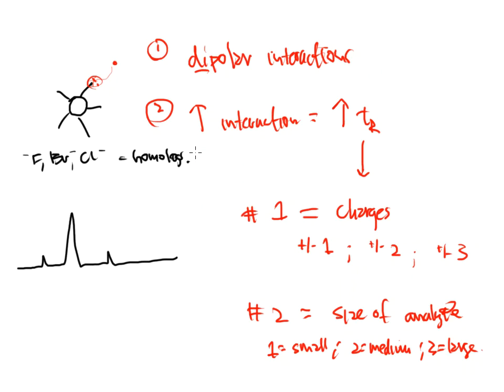They're all -1 here, so number 1 is not going to break it for me. They're all the same charges, so I need something else to go by. We know that these 3 things can be separated, but it's not going to be based on charge because they always have the same one. So now we take a look at sizes. Which one's smaller? Because that's probably going to come off first.